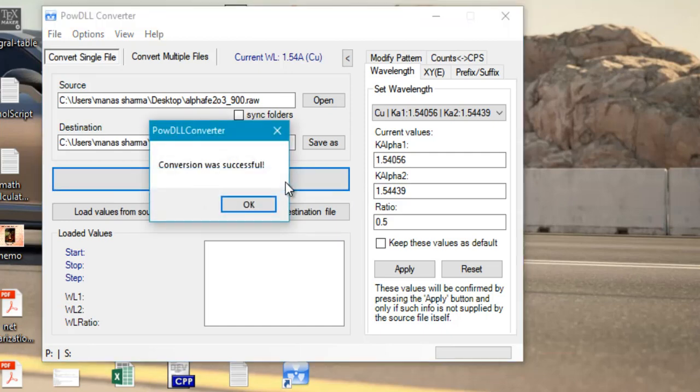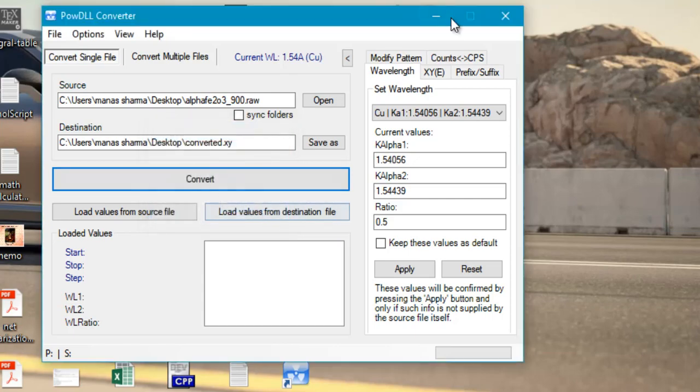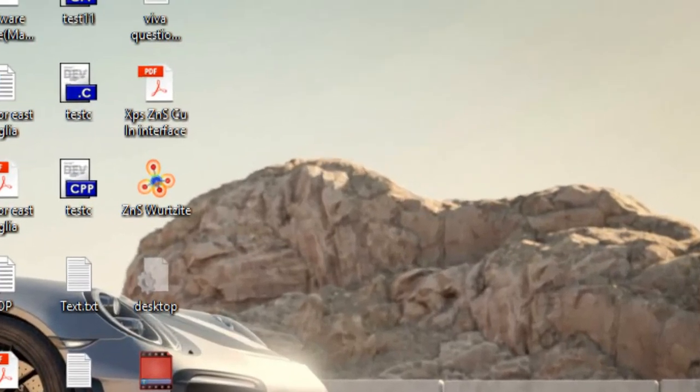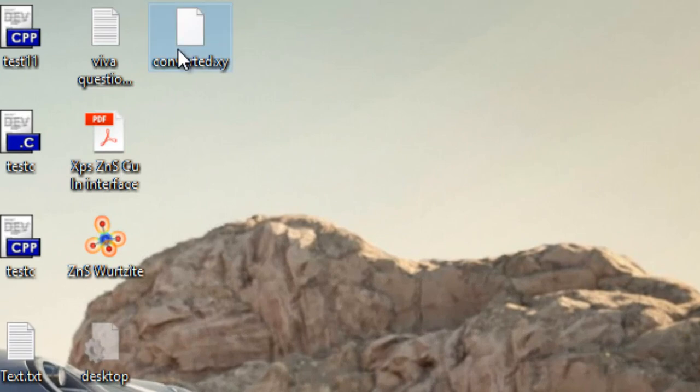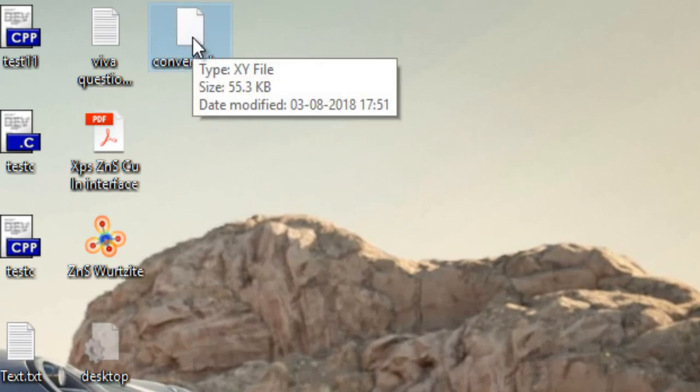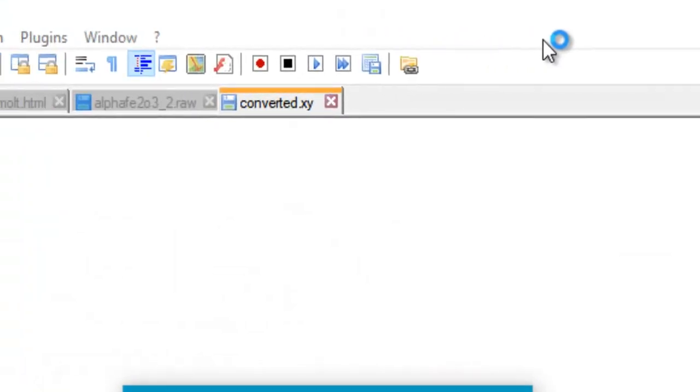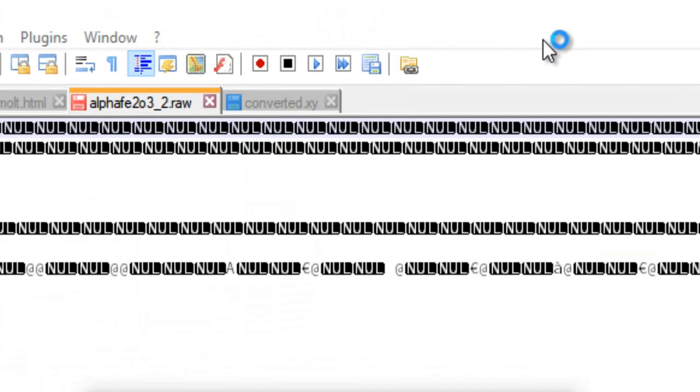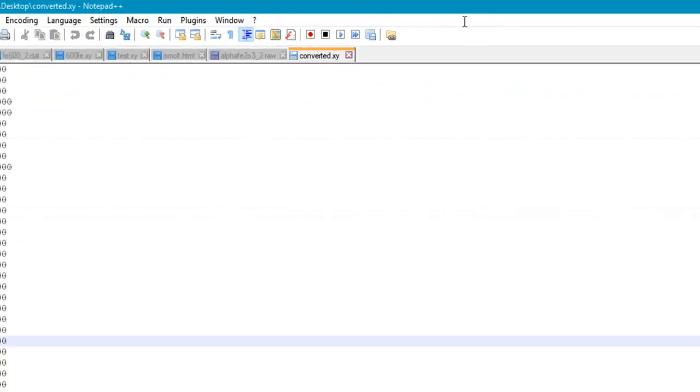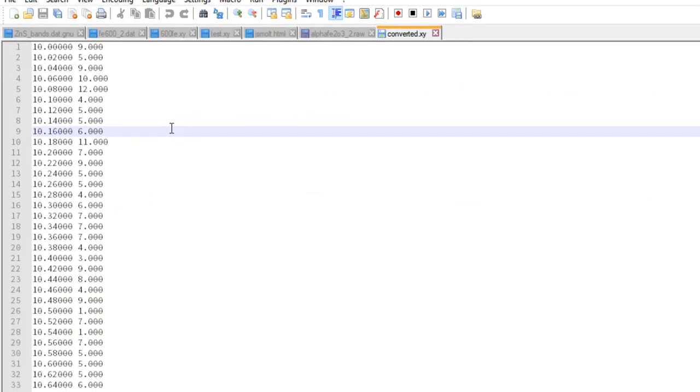It will prompt you that the conversion was successful. Just go ahead to your desktop and locate the file. Here the file is converted.xy file. You can even open it using any text editor. So here it is.